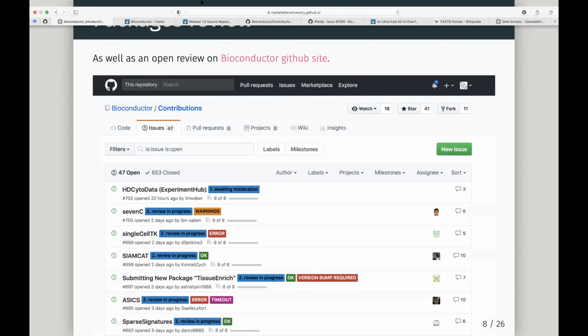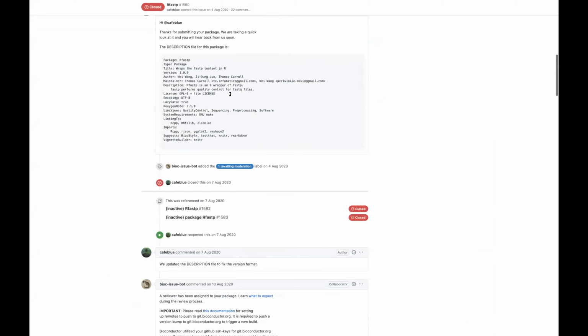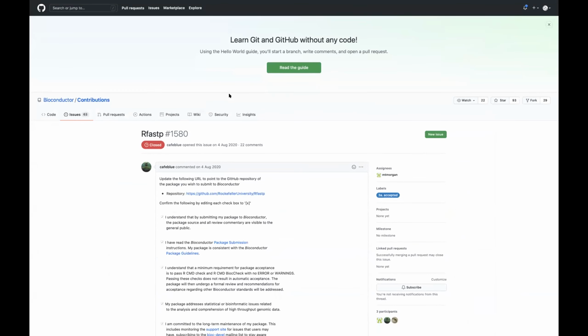There is an open review site. We can go there, and we're going to go spy on. So, you know, Matt has a package, Herper, he's going to show you this. Doug, who's going to come in next week, he has Profile Plier, and we have a few other packages knocking around, but one of the ones I wanted to show today was rfastp.